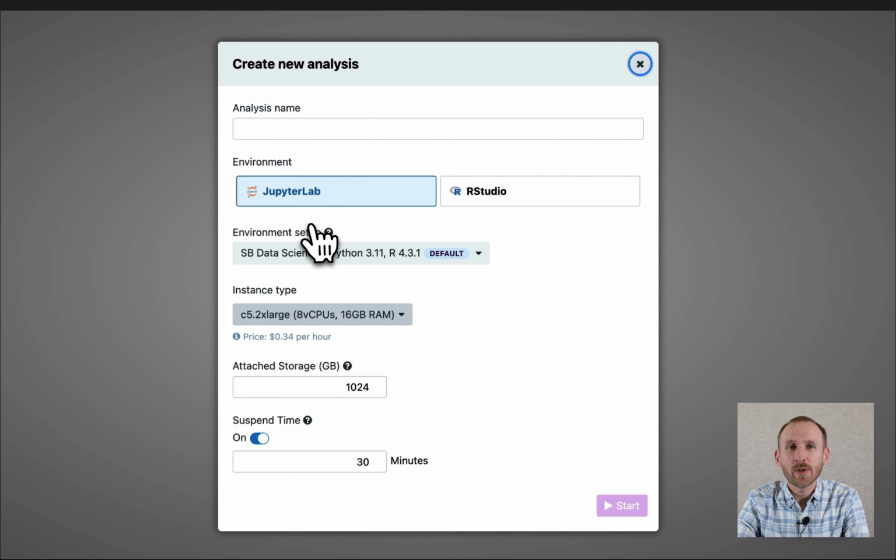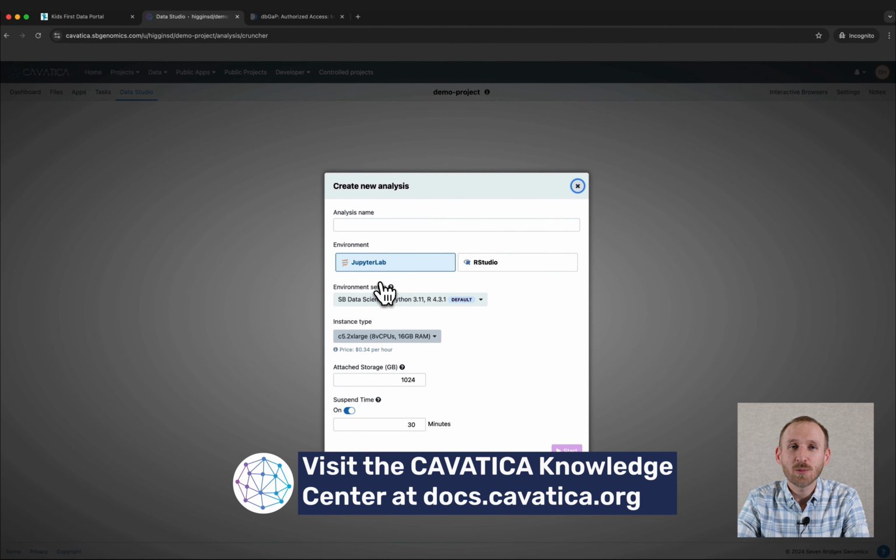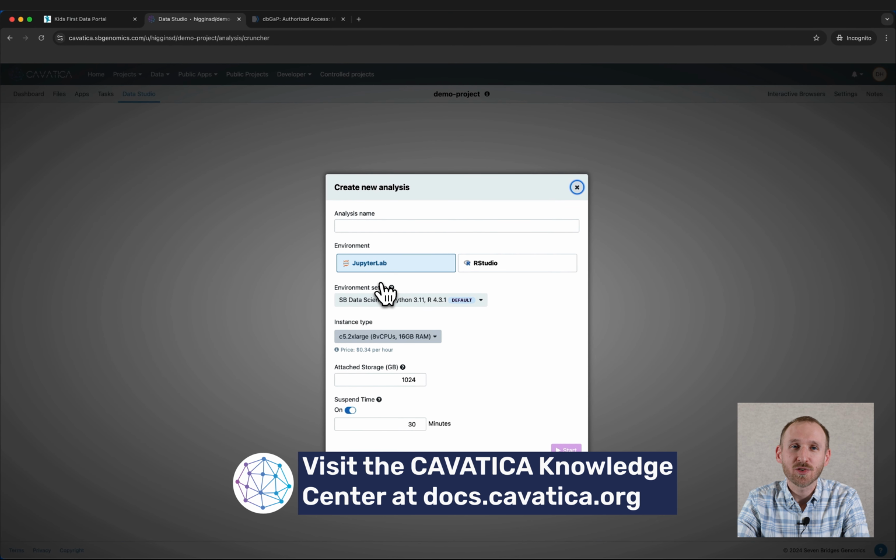Together, the Kids First portal and CAVATICA are a powerful set of tools to empower pediatric research. You can watch additional videos and access resources by exploring the CAVATICA Knowledge Center.